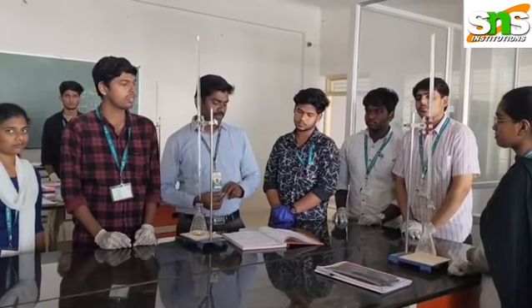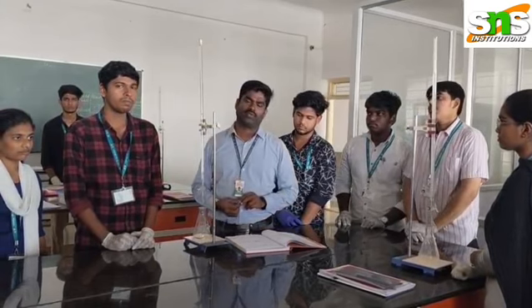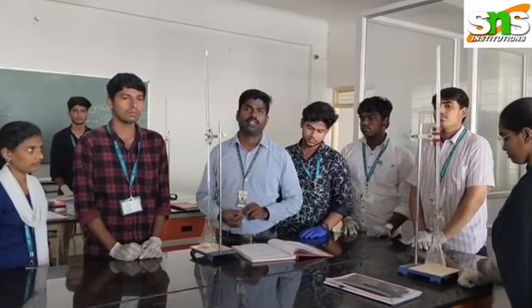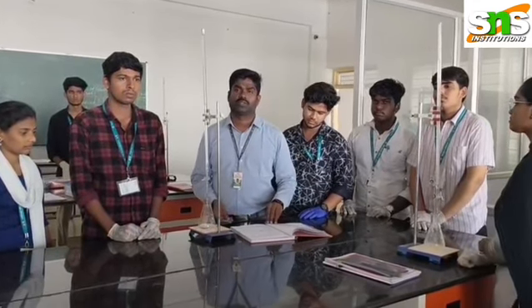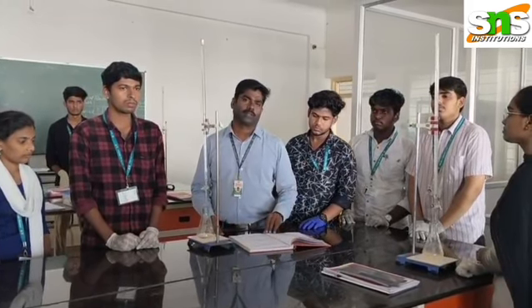So we prepared it by measuring accurately 2.75 ml of concentrated or fuming sulfuric acid. It was transferred to a 1000 ml volumetric flask, and finally the volume was made up with distilled water up to the mark.